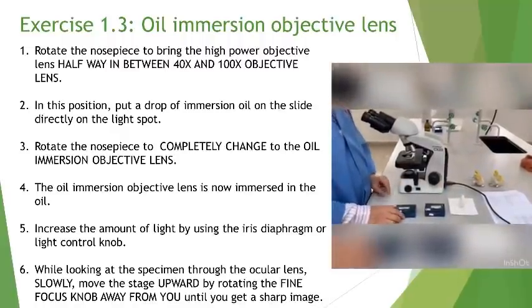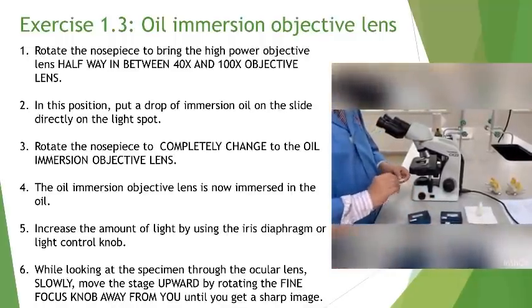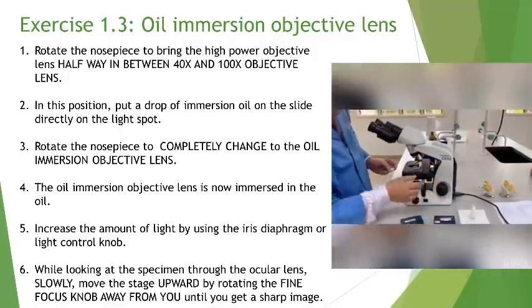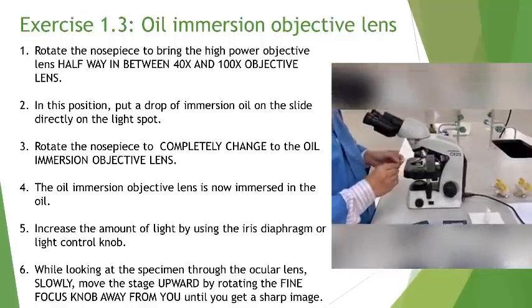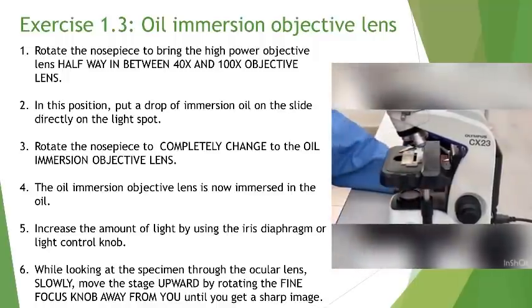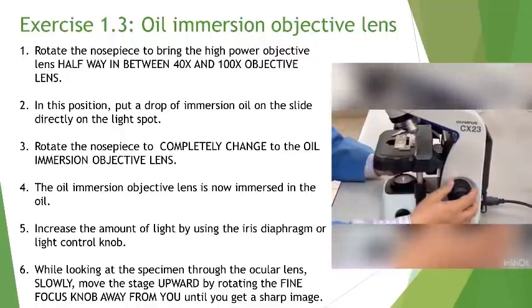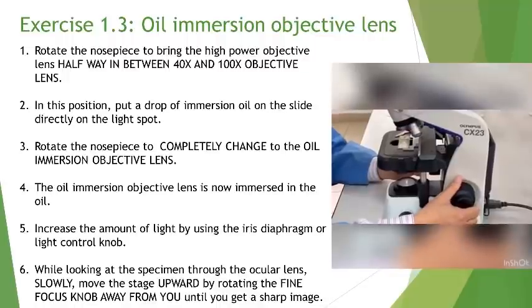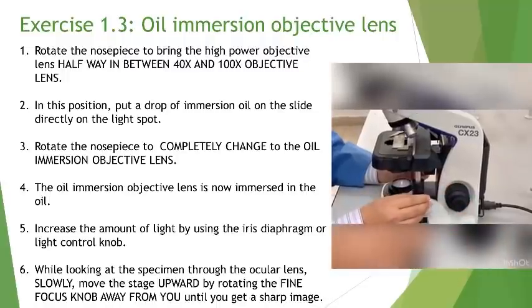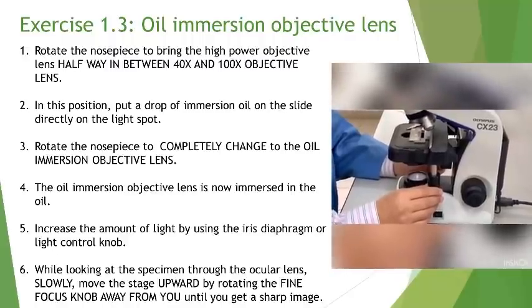So first of all, I would like to choose Escherichia coli for my observation. Again, put your specimen under the lowest magnification, the 4 times objective lens. Put the specimen onto the stage. Observe the image under the microscope. Find the stain, and locate and put the image right at the center of the circle.